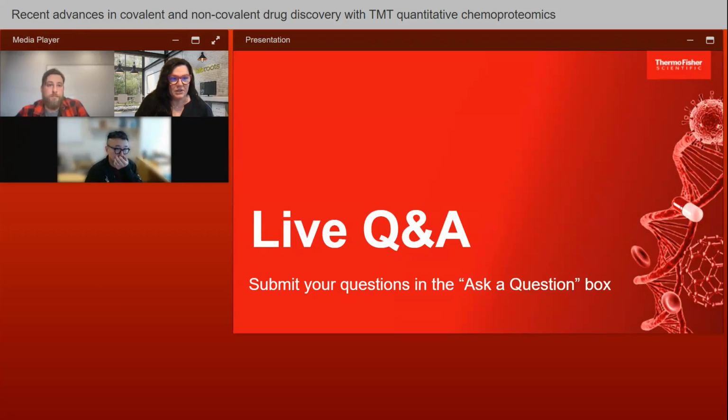All right. And Alexey, did you want to touch on that? I apologize if I cut you off as you were going into your answer as well. No worries. I agree that TMT is a wonderful technology to quantify proteins, to perform relative protein quantification. And if proteomics helps you decipher the molecular mechanism leading to the molecular phenotype of a genetic disorder, then we could find potential protein targets to mitigate those issues for sure.